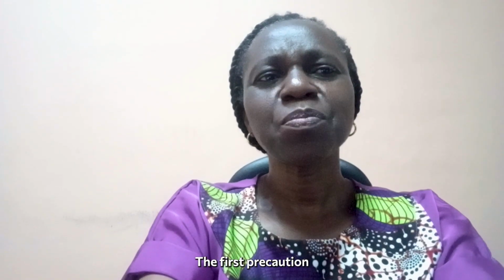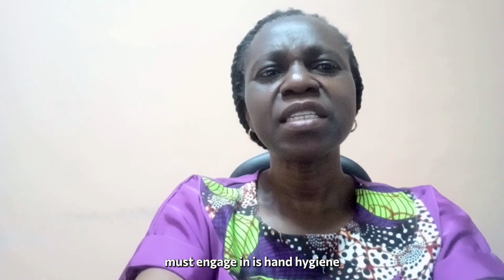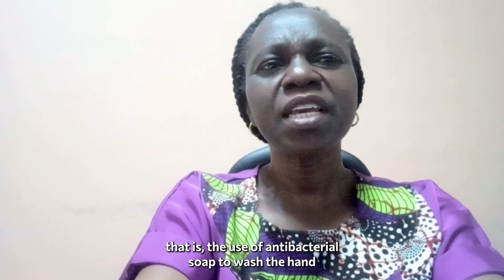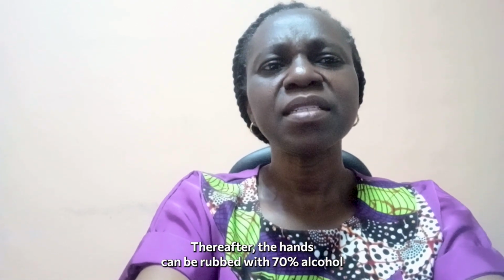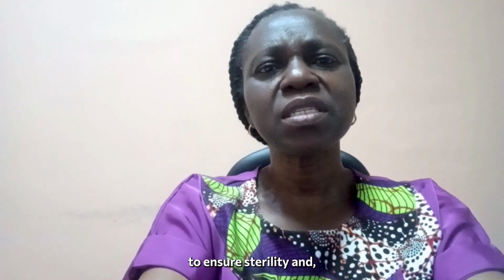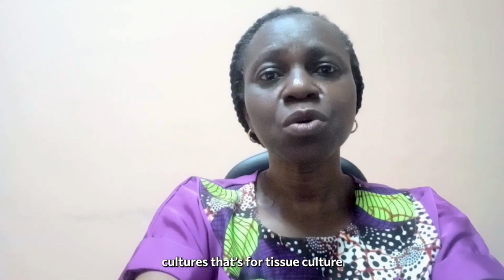The first precaution that a laboratory user must engage in is hand hygiene. That is the use of antibacterial soap to wash the hands for about 20 seconds under running water. Thereafter, the hands can be rubbed with 70% alcohol to ensure sterility and a contamination-free environment for the in vitro cultures. That's for tissue culture plants.